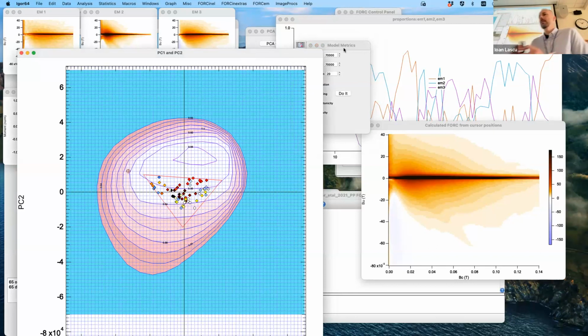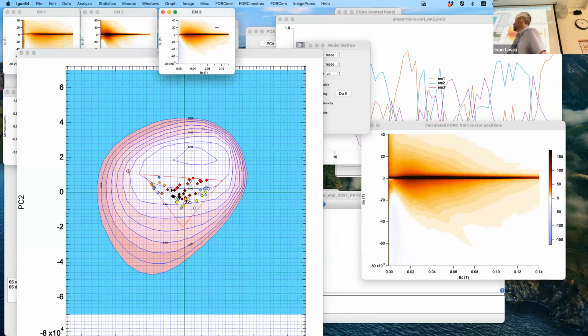No, in this example, you're pointing out that you have unrealistic negative regions on the left-hand side of your diagram, but the end member 1 there is in a pretty okay region. Yeah, end member 1 is okay, end member 2 is okay. End member 3 seems to be... Is that the one with the negative areas? But end member 3 should have negative areas.